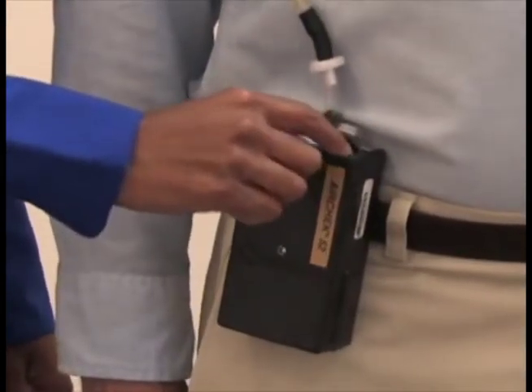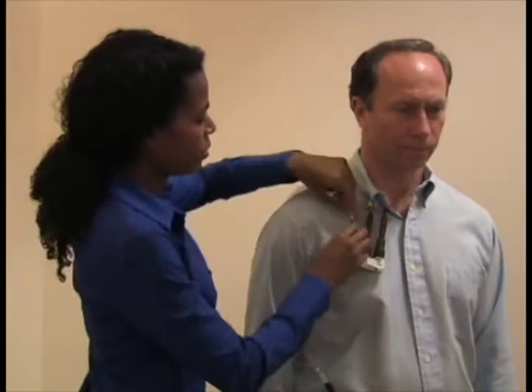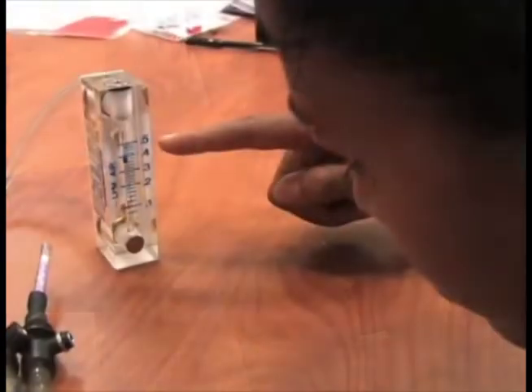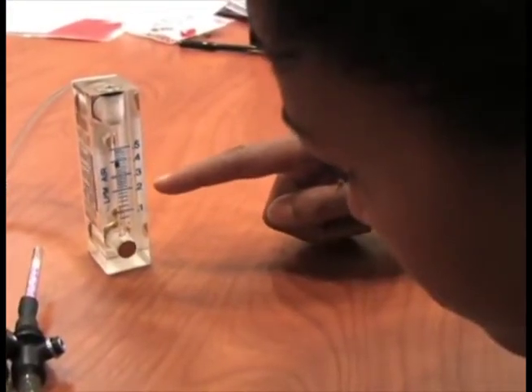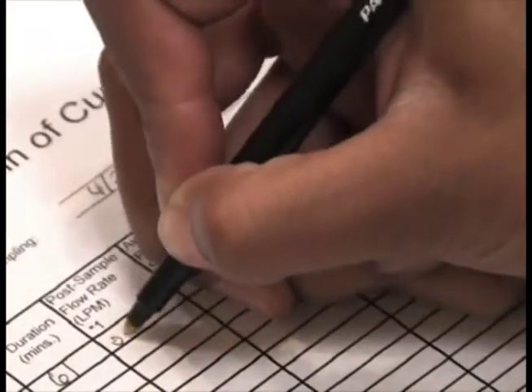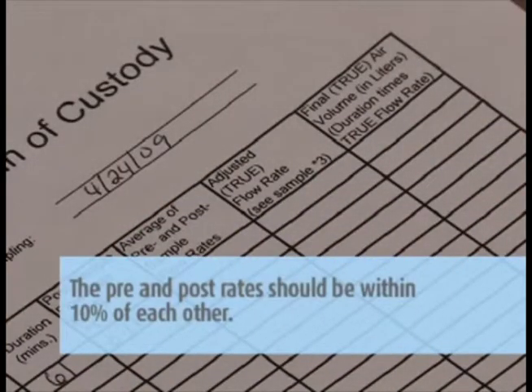After sampling is completed, turn off the pump and remove the equipment. Remove the tube covers, remove the sorbent tubes, and immediately seal the tubes on both ends with the red caps provided. Label the tubes. Perform the post-calibration the same way you did the pre-calibration using the marked calibration sorbent tubes, but do not make any set screw adjustments — just record the flow rate on the pump calibration sheet.